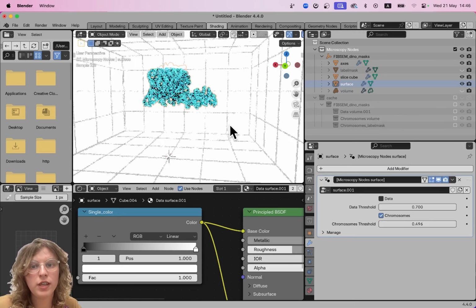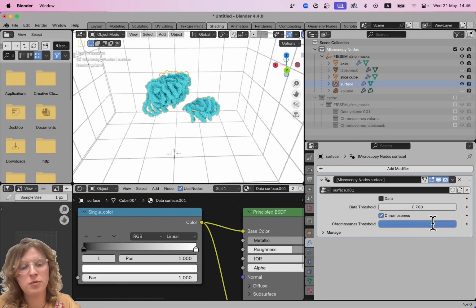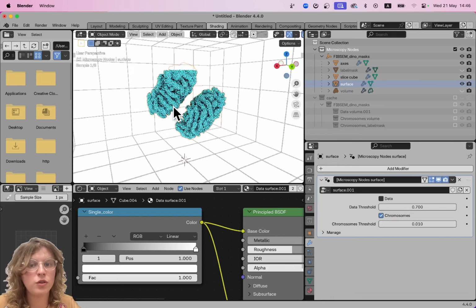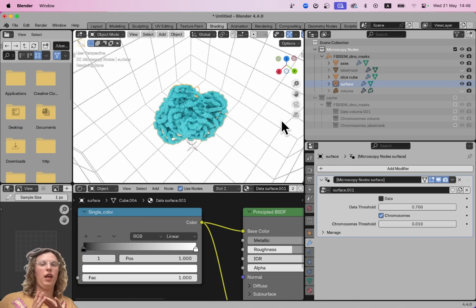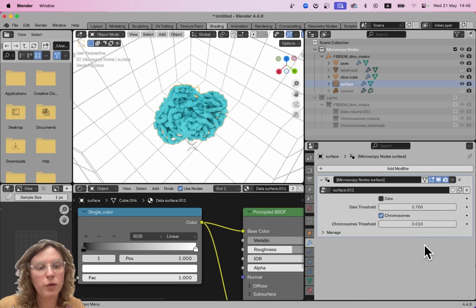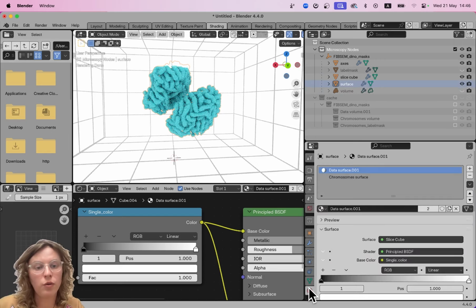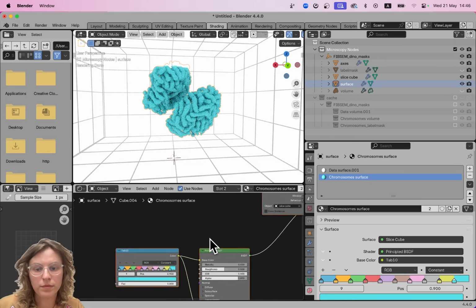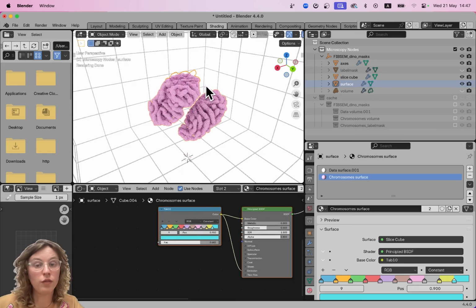And so what's a little bit confusing here is that the chromosome mask that we've loaded doesn't actually contain all of our chromosomes. And that's because our threshold is too high, because what the isosurface assumes is that we actually do have a full data set with whatever data in there. And what we actually put in there now is this mask with specific label values. So sometimes the isosurface still needs some tweaking of the threshold when you're loading, but then this works well to get this single color version. And you can recolor that, but only on all of them.